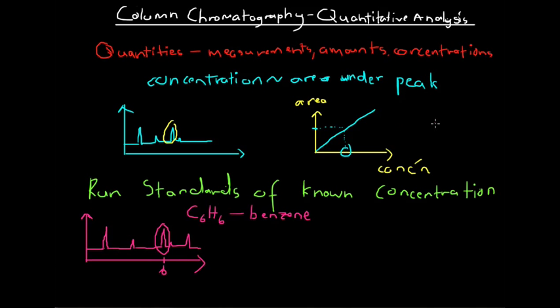What we're going to do, we've got 4 different samples of benzene at varying concentrations. Not pure benzene, obviously, if we're dealing with concentration, but a mixture containing simply benzene and a solvent. So let's say I've got four samples here. I've got this one here. Now we know that this one has been made using benzene with a concentration of 0.4%.